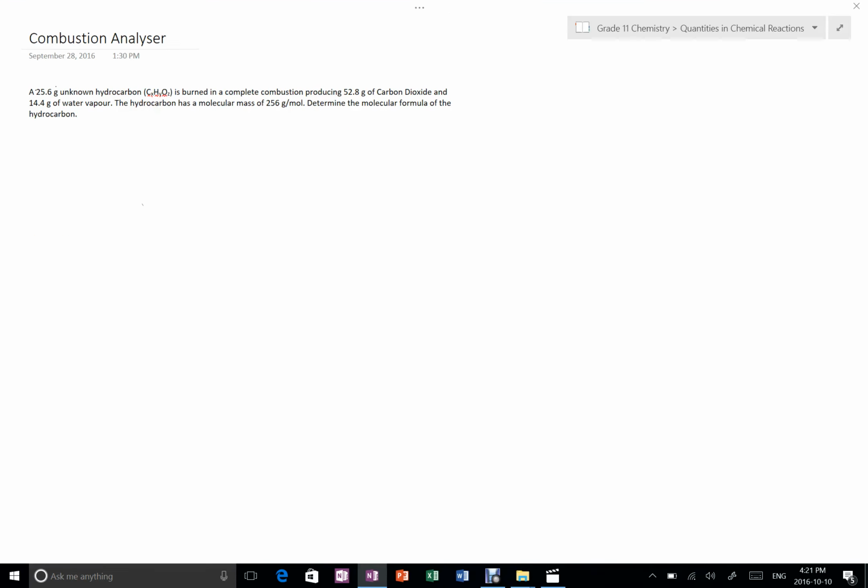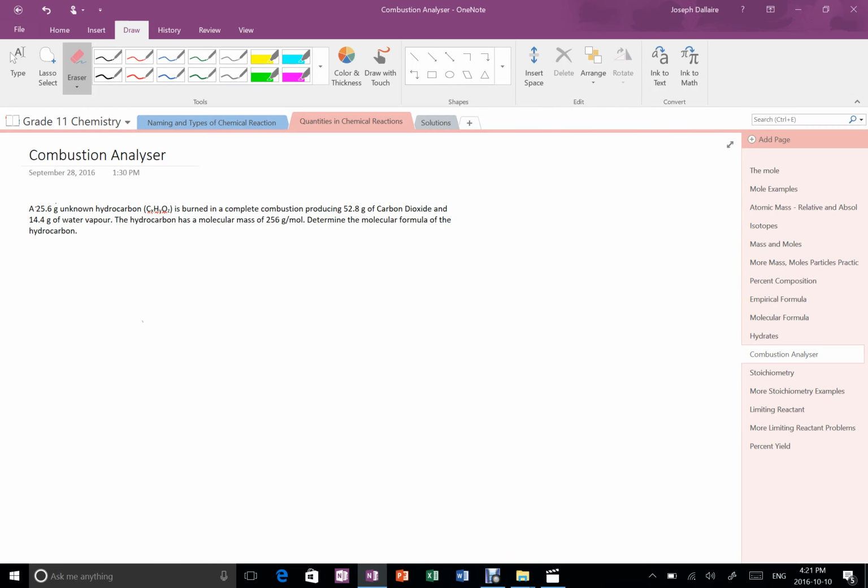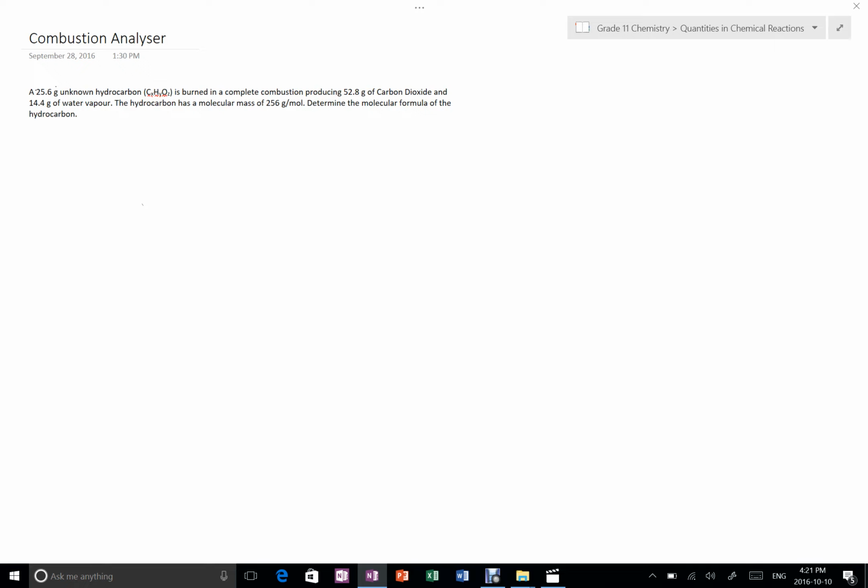Alright, in this video I'm going to discuss the combustion analyzer. A combustion analyzer is one of the ways that we can try to figure out how much carbon, hydrogen, and oxygen is in an unknown hydrocarbon. If we have an unknown hydrocarbon, then what we mean by that is we don't know what the ratio between these atoms are.